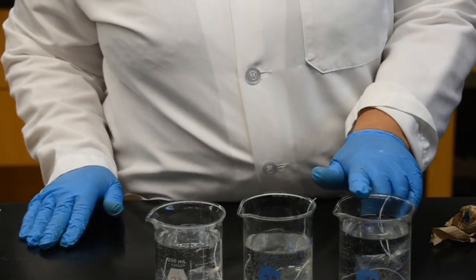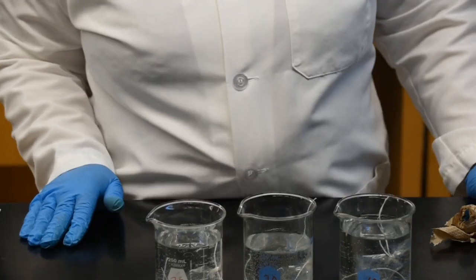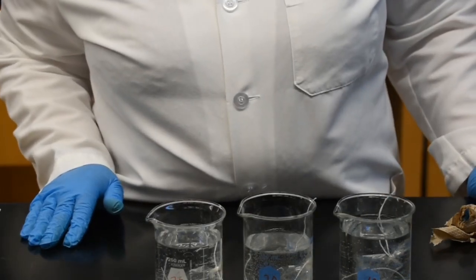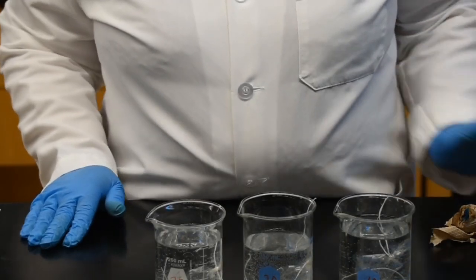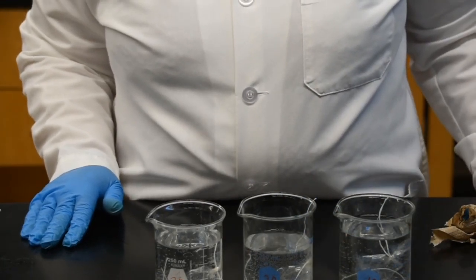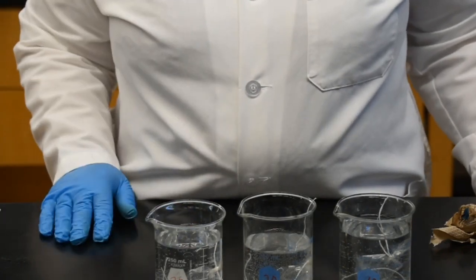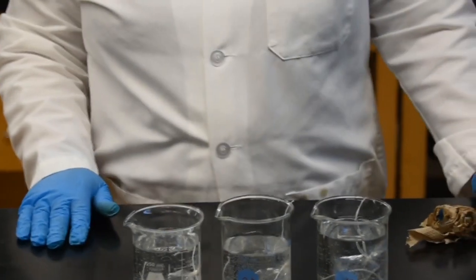The first baggie, our 10%, is currently 15.9 grams. Our second baggie is 13.6 grams. And our third baggie, which is our 30%, is 15 grams.